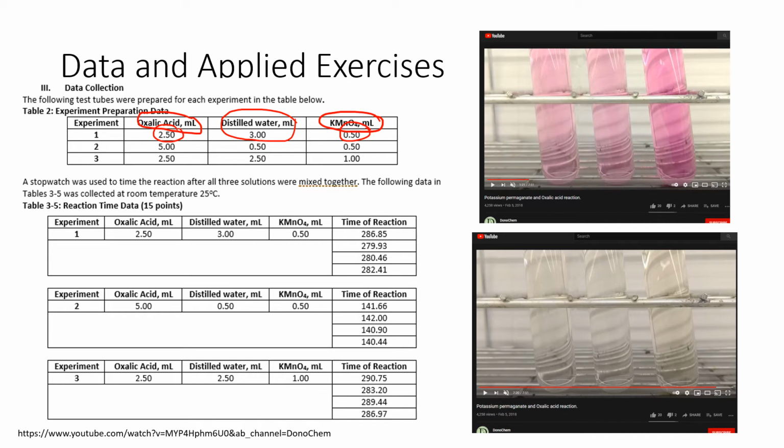If we were doing this in person, these are the volumes that you would actually be mixing in test tubes, as you can see here. This is how your test tubes would look. So imagine that you would be mixing those amounts, okay? So we prepared these test tubes in the experiment. This is a screenshot of your lab handout, so if you want to follow along, if you have that printed out, you can underline stuff, highlight stuff, whatever it is you need.